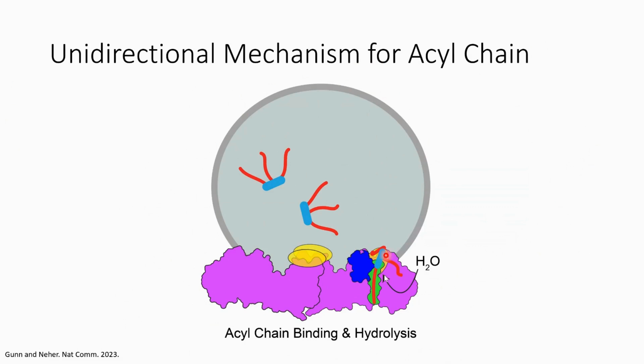This then would allow LPL substrate, the triglyceride, to bind. And we think that there are more substrate discrimination sites here than we had previously thought. It had been previously thought that this small pocket up at the top was how LPL discriminated between different substrates. But it seems perhaps that there's also a hydrophobic pore and then a secondary hydrophobic pocket for the SN2 chain that can also help discriminate to make sure that LPL is binding to the right substrate, specifically the triglycerides.